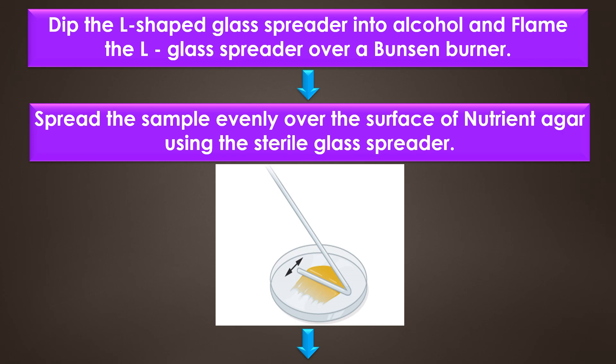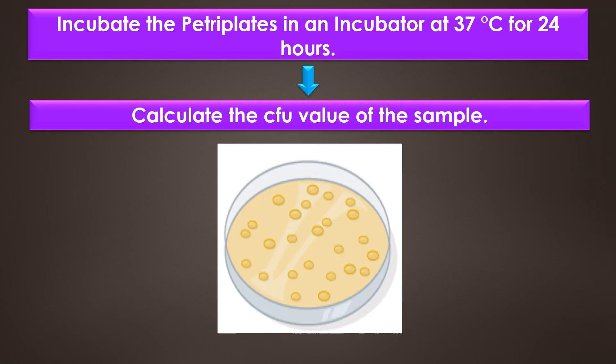After that, dip the L-shaped glass spreader into alcohol and flame it over a Bunsen burner. Then spread the sample evenly onto the surface of the nutrient agar using the sterile glass spreader. Incubate the petri plates in an incubator at 37 degrees Celsius for 24 hours.